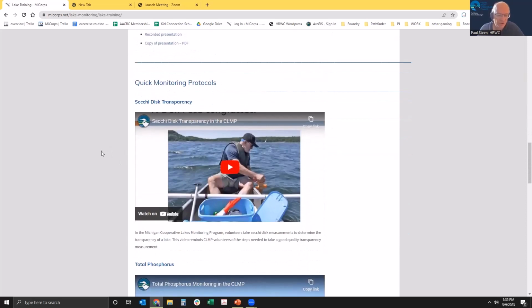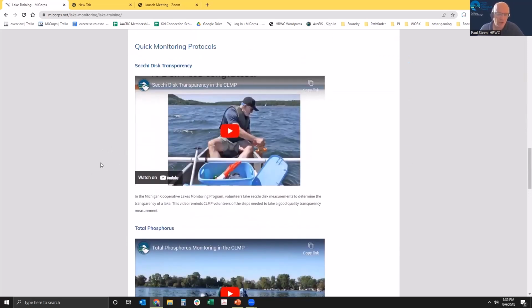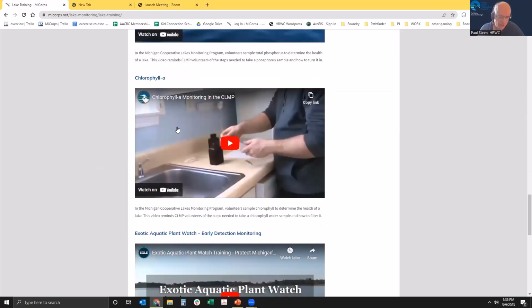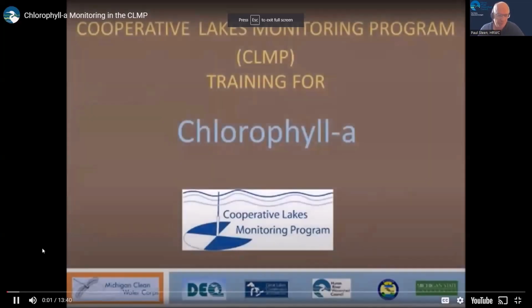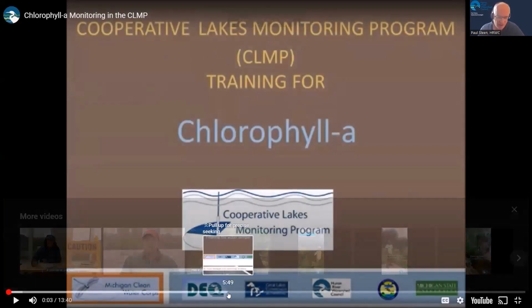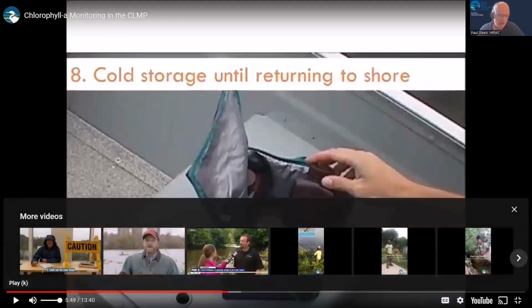So we have a video for each of these parameters that we're going through. Here's Secchi-Disc, here's phosphorus. Okay, and here's chlorophyll. So I'm going to play the filtering part of this. I'm going to make it big. This video reviews, and it starts at about 5 minutes and 50 seconds. All right, so we're going to start there, and then I'll come back when we get through the filtering section.